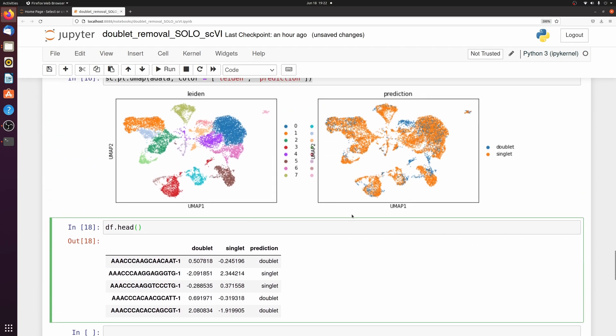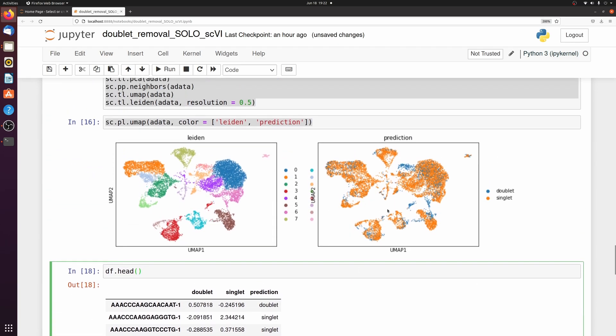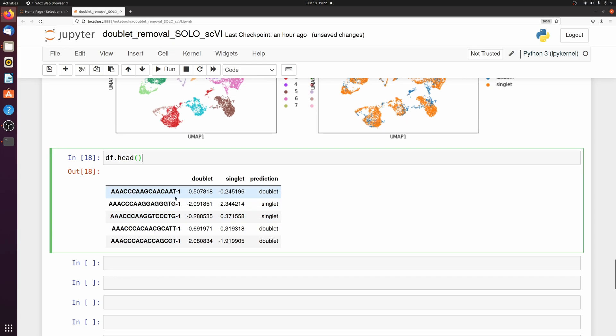And then let's just go back to the dataframe. So what I want to do is now apply this to my fresh data. So I'm just going to load in the data again and then apply a filter to it. So I'm going to make a little dictionary of the cell barcodes and the prediction, and then a little function to map it.